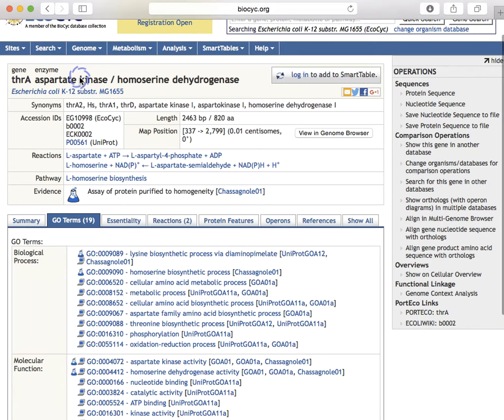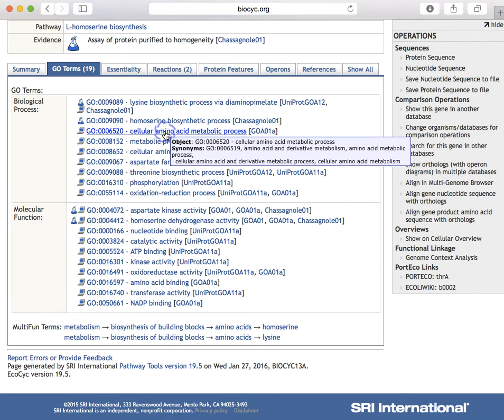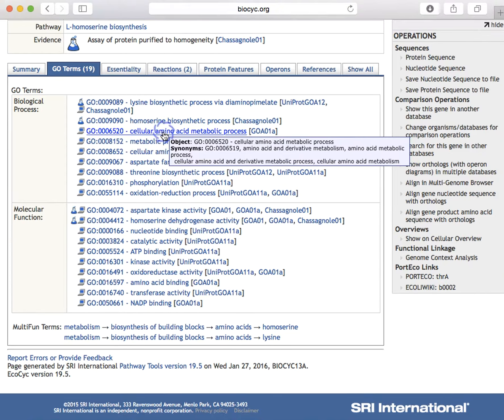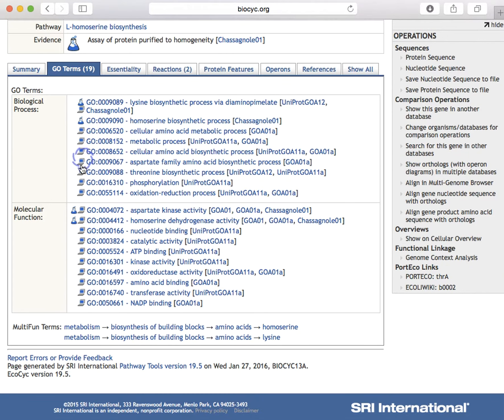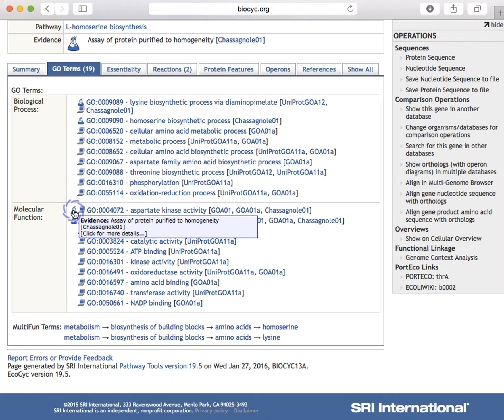The gene ontology term pane is fairly self-explanatory. Note you can mouse over and click on the evidence codes for more information about what evidence supports the assignment of a given GO term to this gene.